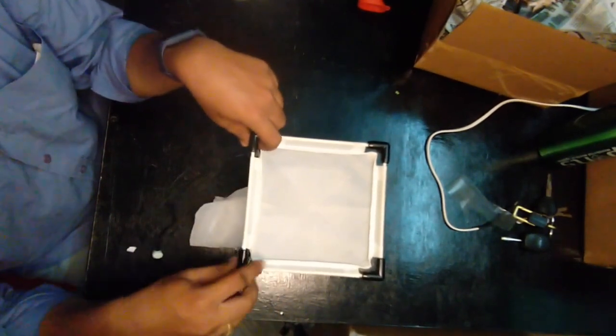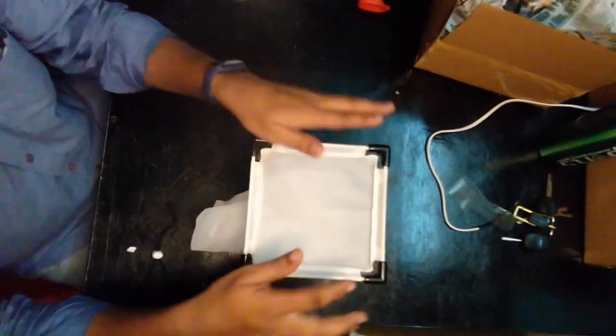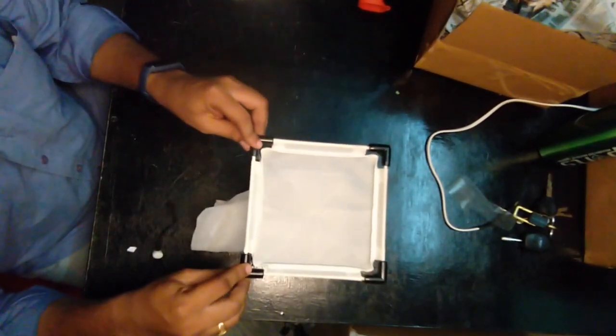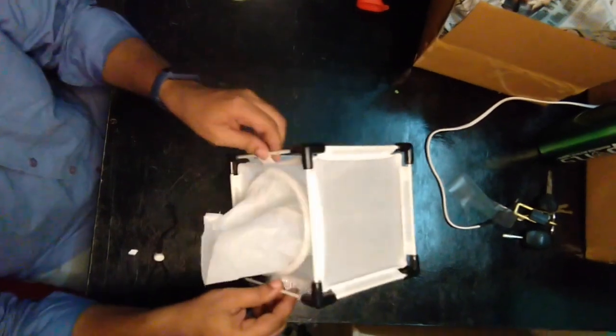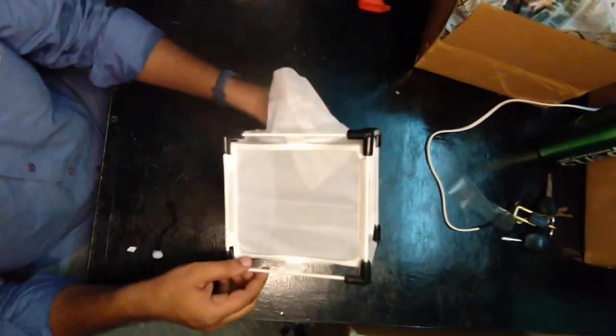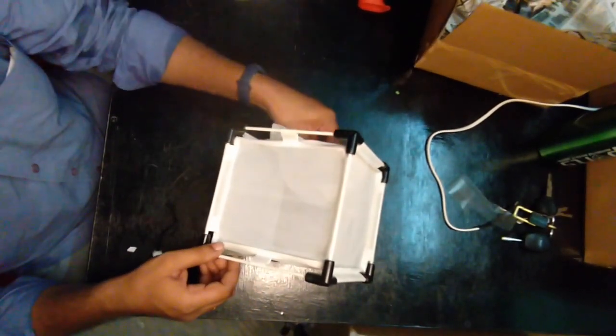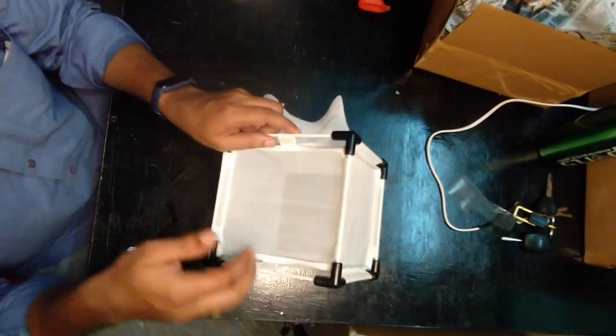Once you have installed the cage, the better way to check whether the cage is installed properly is by placing it onto a flat surface and then checking it.